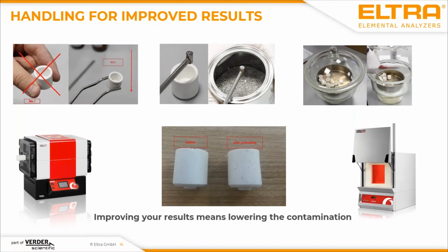And the typical temperature which you should use for preheating the crucibles, which you find in some standards too, is 1000 degrees centigrade. You cannot do it in your normal drying oven. Please use a special furnace which reaches temperatures in the range of 1000 degrees.